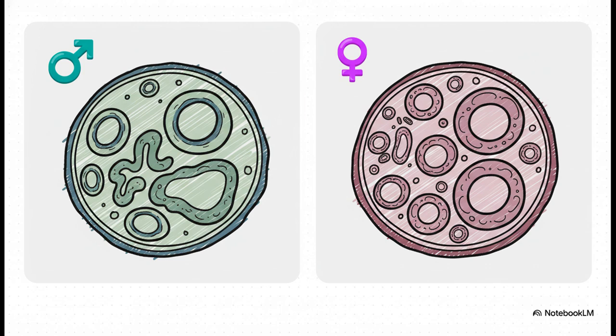This is where you see the biggest difference. In the male cross-section on the left, you'll see a few circles, which are sections of the single testis and maybe the large vesicula seminalis. But look at the female on the right. It is packed with circular structures. These are all the different sections of her paired ovaries, her oviducts, and those very large, thick-walled uteri, which would be full of eggs. It's much more crowded in there.